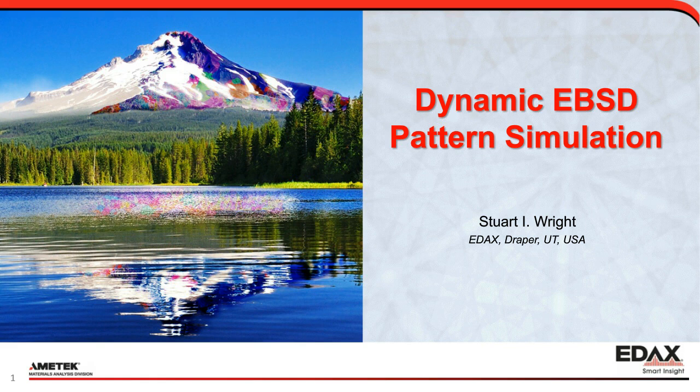The original OIM system at Yale could index approximately one pattern in 3 seconds. Modern systems have come a long way since those early days, with speeds now exceeding 4,500 indexed patterns per second. Stuart is closely involved in the continued development of the technique, as well as in working with scientists all over the world in applying the technique to their materials research. And now over to you, Stu.